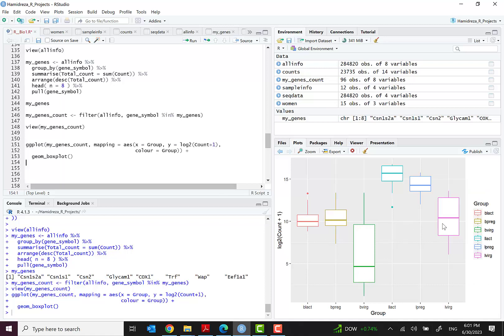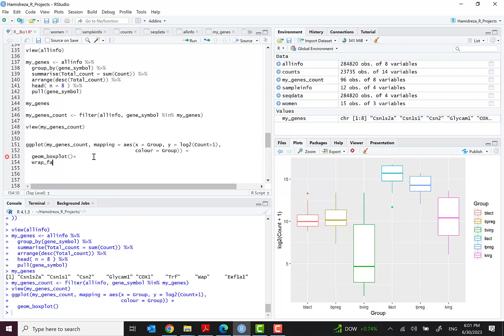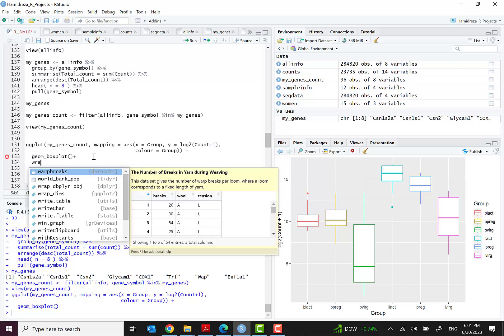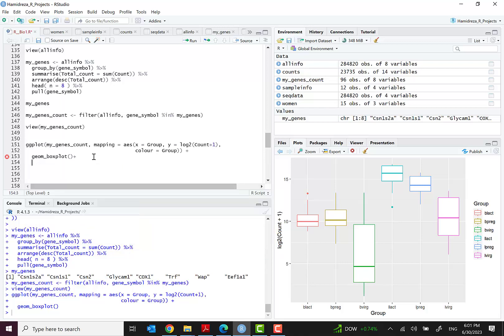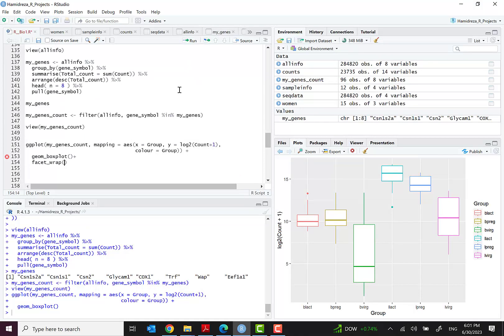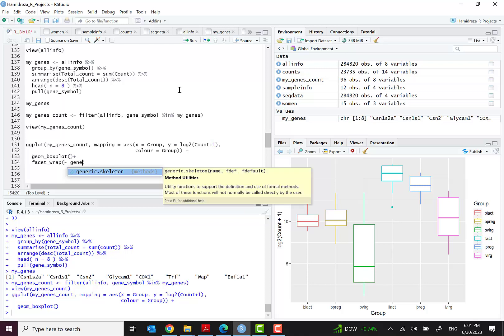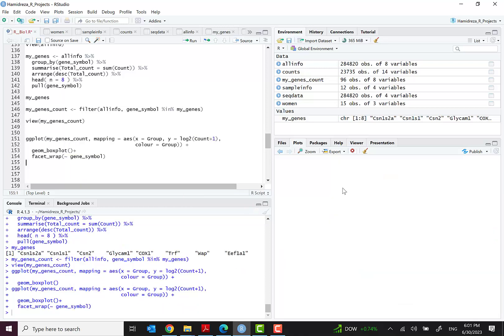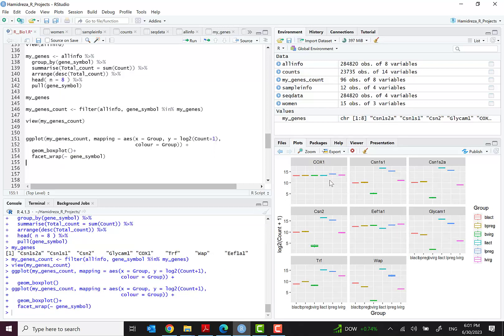When we want better visualization with more meaningful information, we can use a new method called facet_wrap. I'll show you how this works. We add facet_wrap based on gene_symbol. Now we can see that based on the gene symbols we have different visualizations for each gene — these are the genes of interest, and based on the group you have different plots. However, the boxplot is not giving us very meaningful information here, so we will switch to a scatter plot using geom_point.